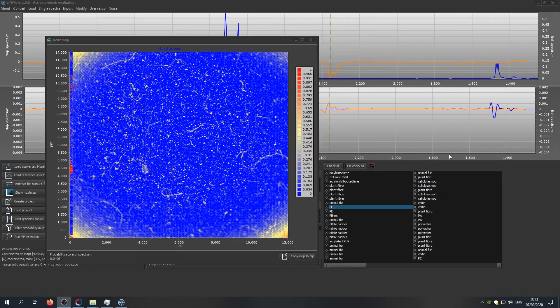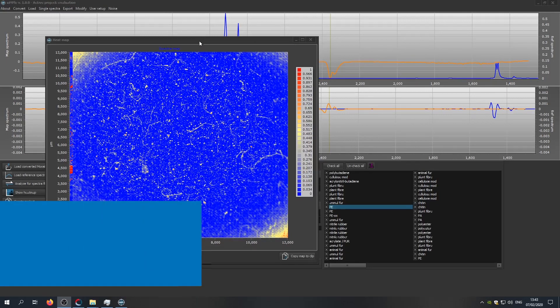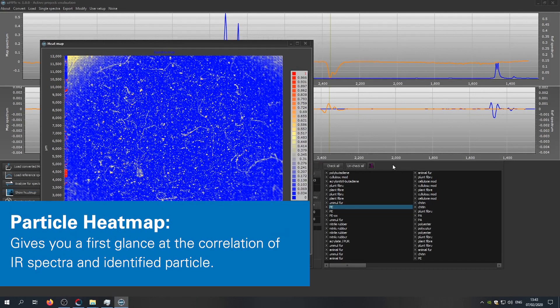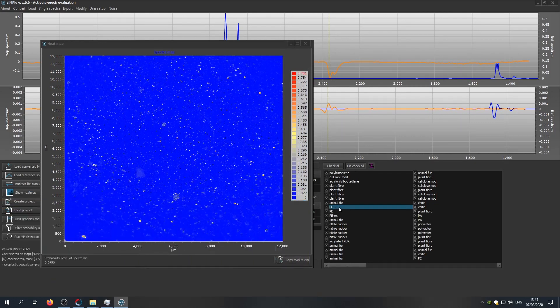After the correlation analysis is done, you can have a first look at your sample by opening the heat map and show the correlation to a certain reference spectrum just by clicking on it. And you will be shown the correlation map for this polyethylene type or for example polyamide.